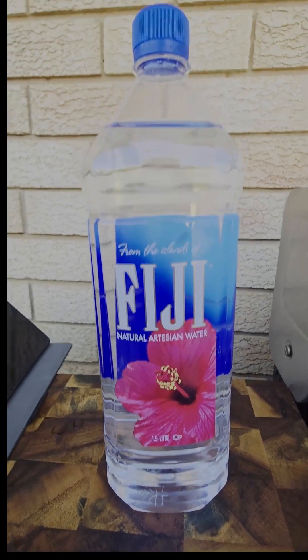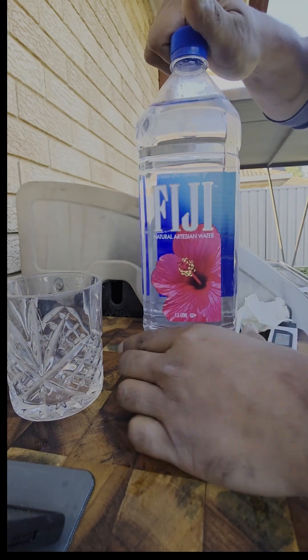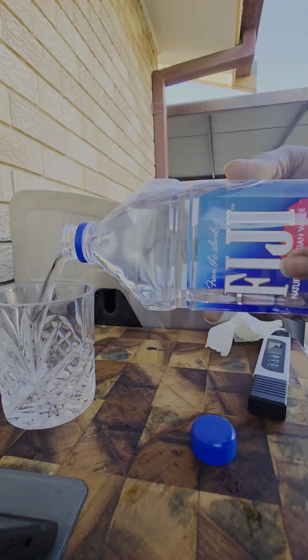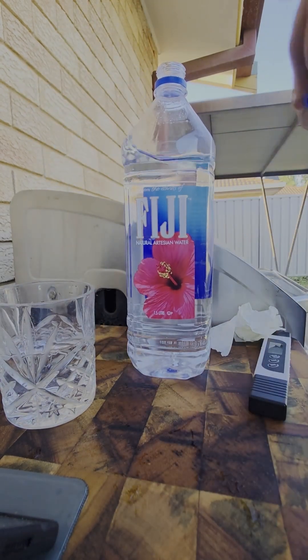Have you ever wondered how safe is the bottled drinking water available in Australian supermarkets? Well, to determine this, one of the parameters is TDS reading. It is recommended that the safe TDS value range is from 50 to 500 ppm.